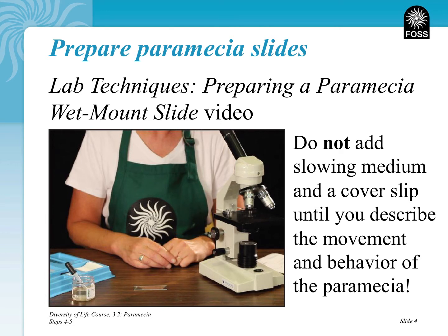This little video is going to show us how to set up a wet mount slide for paramecium, both before and then after a slowing medium is added. They're going to add something to slow them down because they're a little fast. So before we do that, you're going to want to describe the movement of the paramecium and its behavior as well. So let me show you that video and we will go from there on how to set up this wet mount slide.